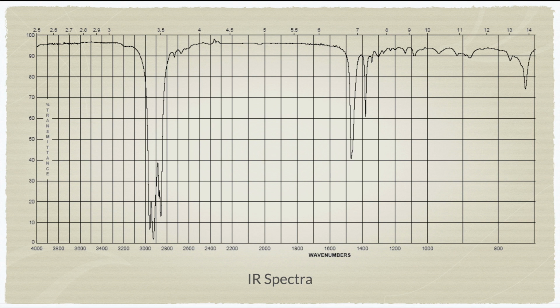If you look at the UV visible, the spectra looks something like this, and then you have a band like that. So we have a hillock in the case of UV visible. But everything will be the same, it doesn't matter. It's just that IR is plotted in such a way that you plot the transmittance percentage versus the frequency.